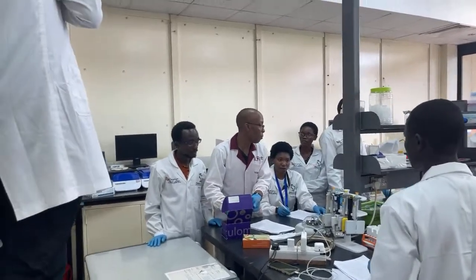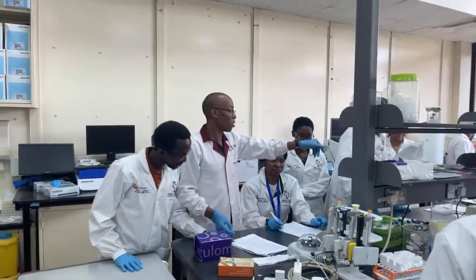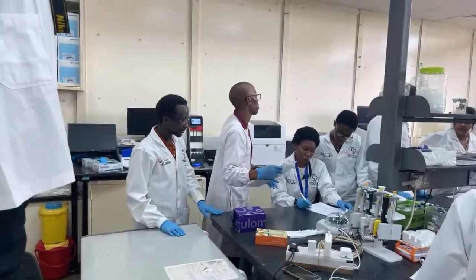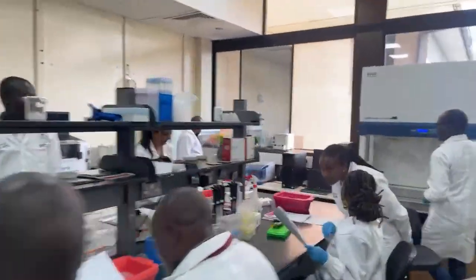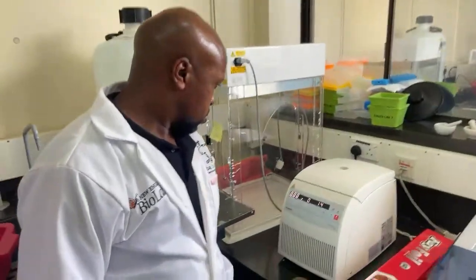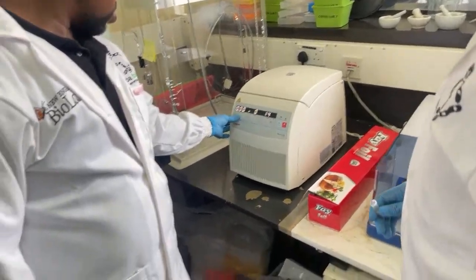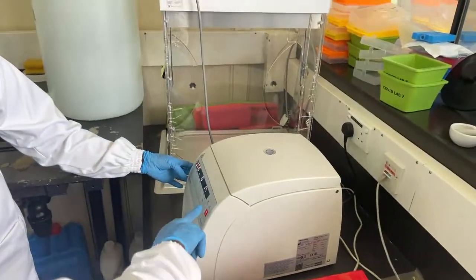Pulse field, pulse frequency, and then this thing can go to the centrifuge for 5 minutes at 10,000 g. Yeah. 5 minutes, 20. So the speed is at 0. No, we haven't started. Ah, okay. So you're open.